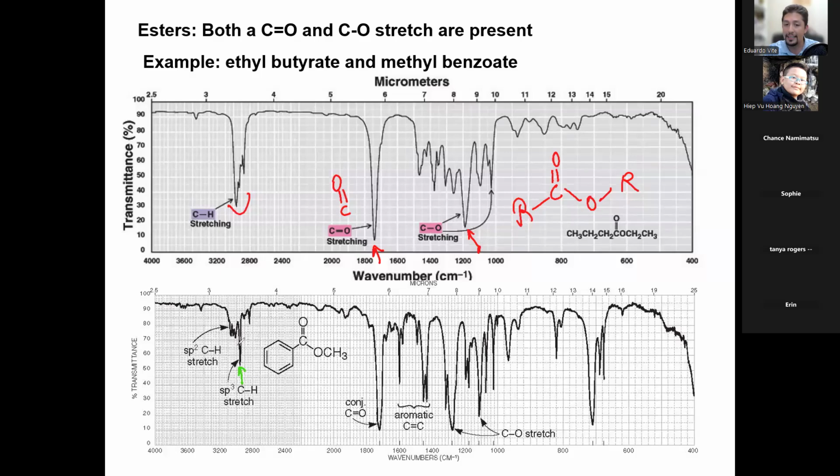Instead of the stalagmites, their intensity decreases, because remember now you have an sp2 hybridized carbon. It's a lot stronger, so you see the intensity is a lot less. The peaks are also a lot sharper. Notice here at the bottom molecule, you still have this carbonyl right there, and you still have the same intensity. It doesn't really affect the carbonyls that much. You also have a few sharp peaks a little bit lower than that, because carbon is lower than oxygen in terms of molecular weight.